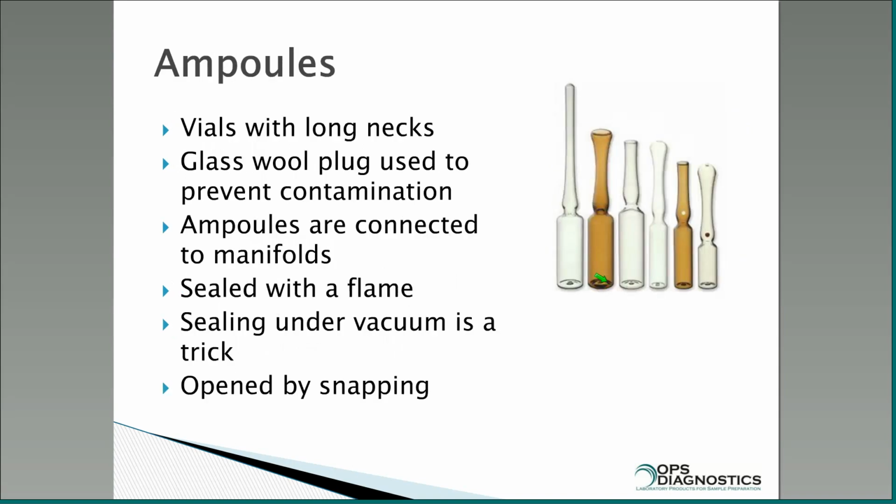Ampoules, just a selection stolen from the internet here. Again, they're also glass. They have long necks, so you put your samples down here, and normally you would put a piece of glass wool or something in here in order to seal this off so that when you're handling it, you don't have to worry about contaminants getting back into your sample.